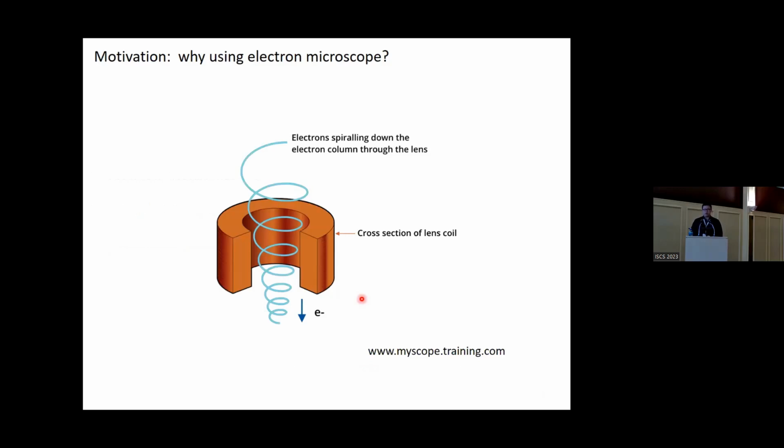However, over the 300 years since the first visible light microscope was invented, we have reached a point where perfect glass lenses can be made. However, in terms of electron lenses, we are not really good at making them. I'm sure we all have the experience when we were younger, we used a glass lens to focus the sun's rays to burn our homework. But if you remember correctly, it is always very hard to focus the sun's rays to exactly one point. We will always have some weird shape.